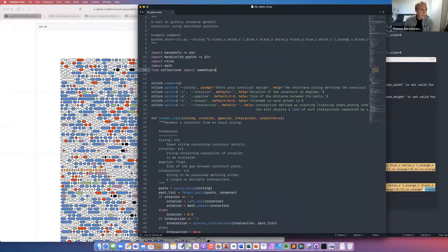Yeah, I've got some love from Prashant there in terms of he likes DNA Plot Lib. A lot of blood, sweat, and tears went into making that easy to use, and it does produce some really nice diagrams. And I really think that once we can replace the rendering backend with this, it's going to make maintenance longer term much easier, and means we can focus on more interesting things, like I said, maybe multi-chromosomal layouts or multicellular type stuff. We can put effort into that rather than just maintaining glyph libraries, which is not the most fun thing to do.